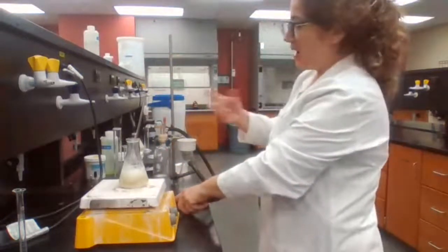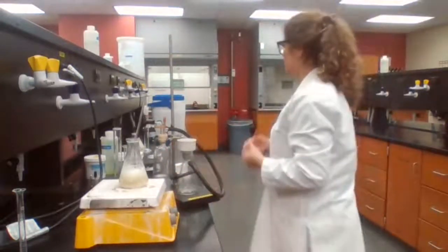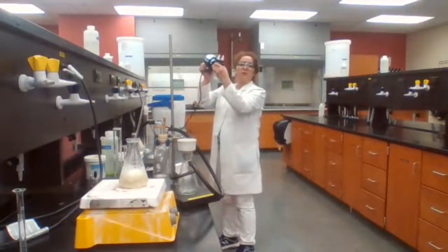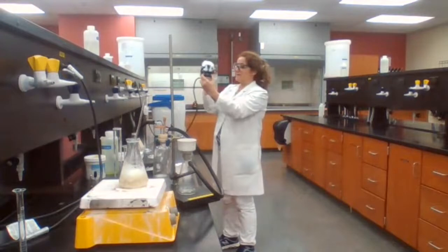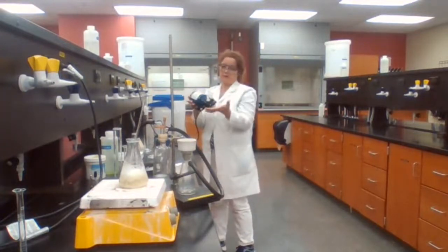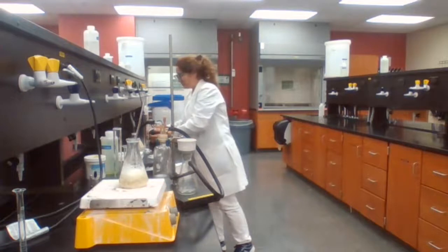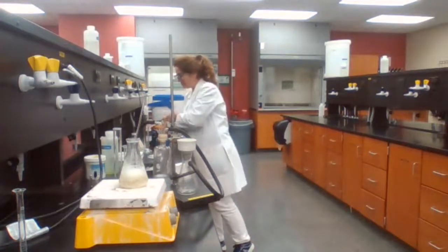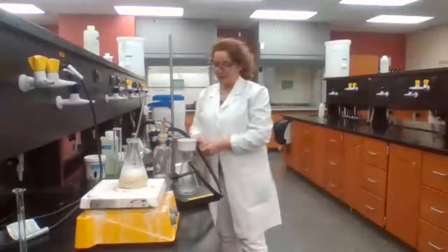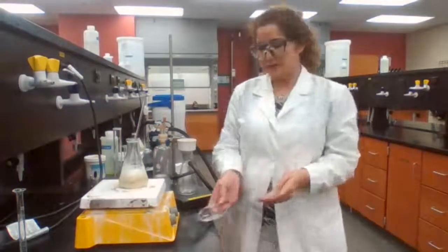Today the vacuum system is off, so I'm going to use a vacuum pump, a smaller device to create the vacuum. The vacuum is not as strong, but it works perfectly for our experiment.